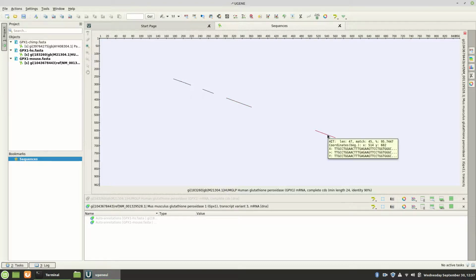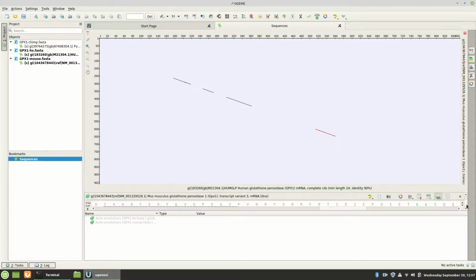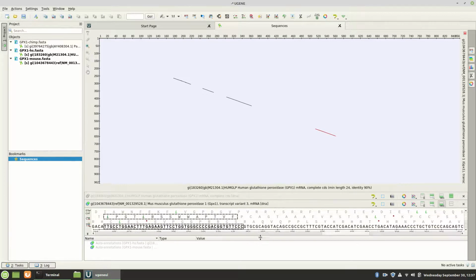We would copy those and try to find these inside our other species. I hit something down here that lost my, I think they're right there. And I can't seem to, there we go.